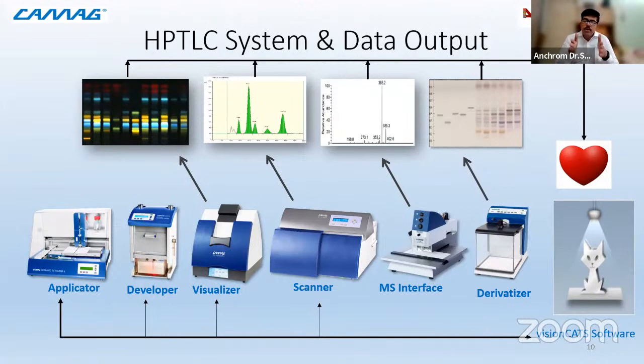Then we have another module, which is the developing device. This device also does multiple things. First of all, after the application, it will condition your plate surface with a set humidity. Humidity is one of the important aspects in HPTLC, and one of the parameters why variation is observed. The surface absorbs moisture, and because of this, when the band is being separated, it gets diffused because of the water present on the surface.